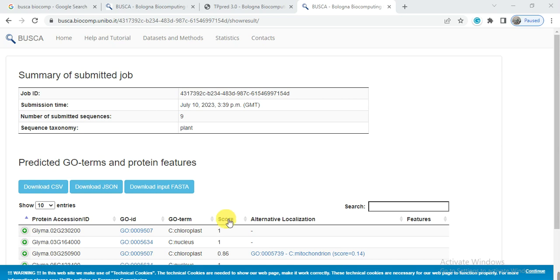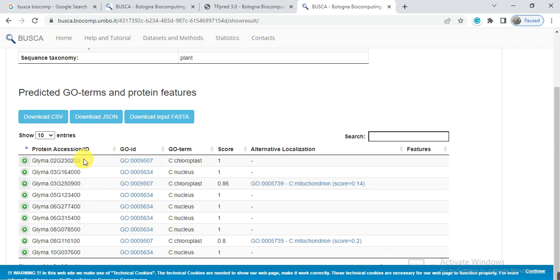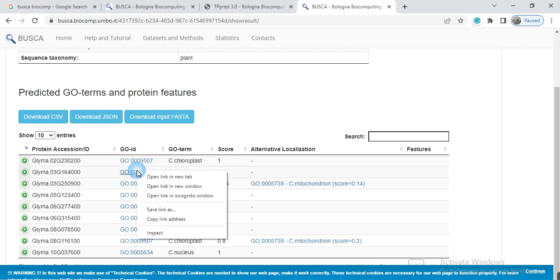So here are the results. So these are my gene names and these are their GO IDs, and you can download it in CSV form and then use it into your objective. So if you want to check, you can click any GO ID.